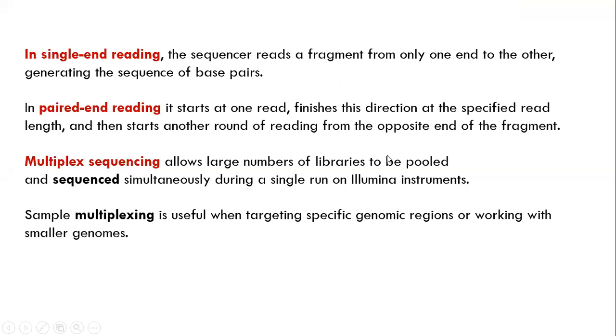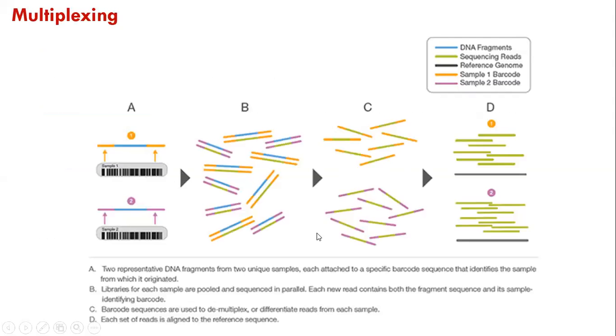Multiplexing is again a pool of DNA. It's directional, but again, not a single stretch. A lot of pooled DNA can be given, and a lot of pools of DNA can be sequenced simultaneously, not a single stretch of DNA or double stretch of DNA. A varied pool of DNA can be given, and all pools can be sequenced at the same time. That is multiplex sequencing.